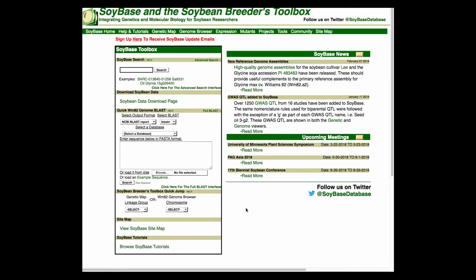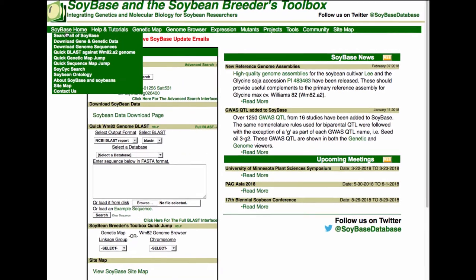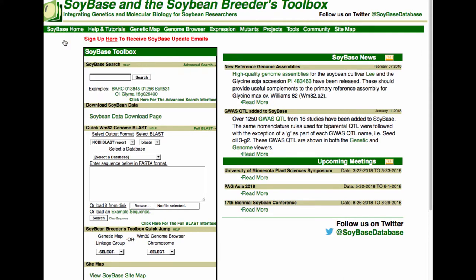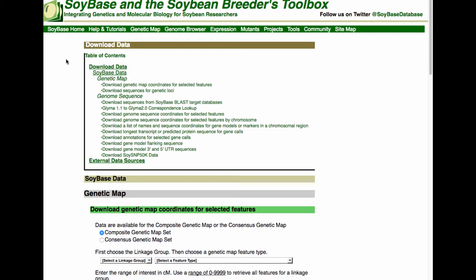First, we go up to the SoyBase homepage and then click the Download Gene and Genetic Data tab. That will take us to the Download page, and in the Table of Contents, the last item is Download Soy SNP50k Data.